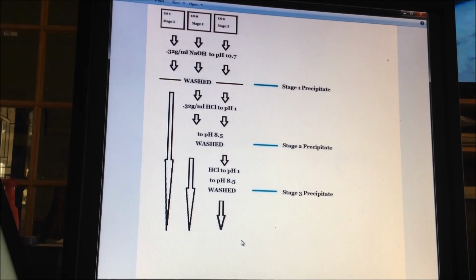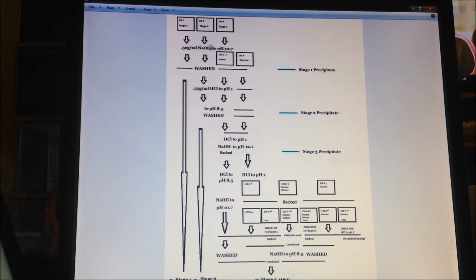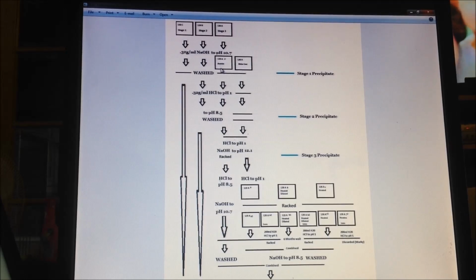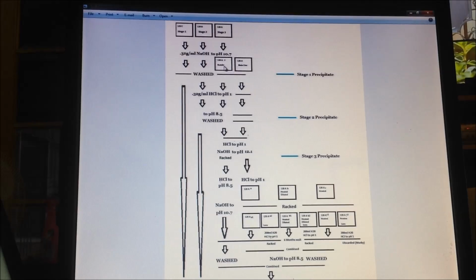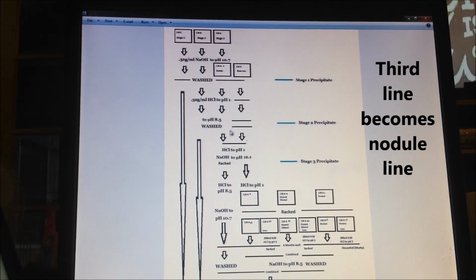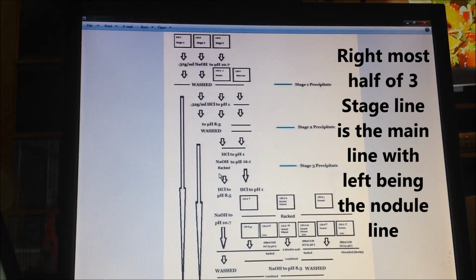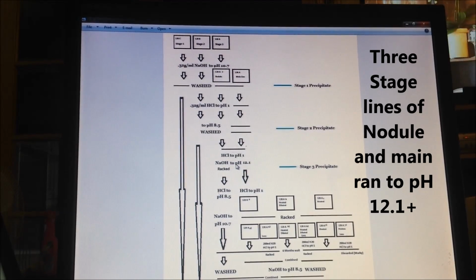Now for what actually happened. The first stage precipitate and the second stage precipitate by and large went through without incident. One that required 3 stages, then a very large nodule formed, which I thought, oh, I can't leave that out, and I can't put it in, there could be something different about it. So I split the sample and followed on from there, and going from the second to the third stage, believe it or not, both of them overshot, which is pretty easy to do.